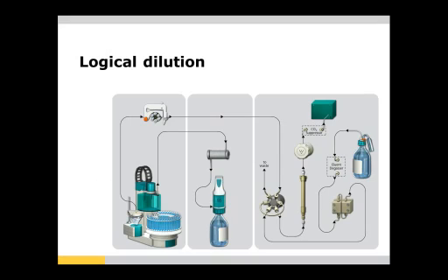The setup for the logical dilution looks like this. On the right hand side, what you see is a standard anion IC system, and on the left hand side, what you see is an automation with the external dilution setup. In the middle of the instrumentation is a liquid handling device called a Dosino, and it has 1/10,000 resolution, meaning that depending on the burette volume connected to the system, from a few microliters to a fraction of a microliter can be pipetted out using this device.